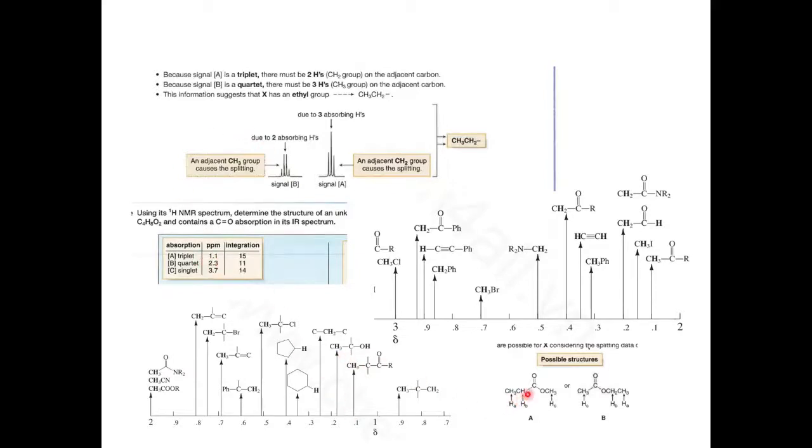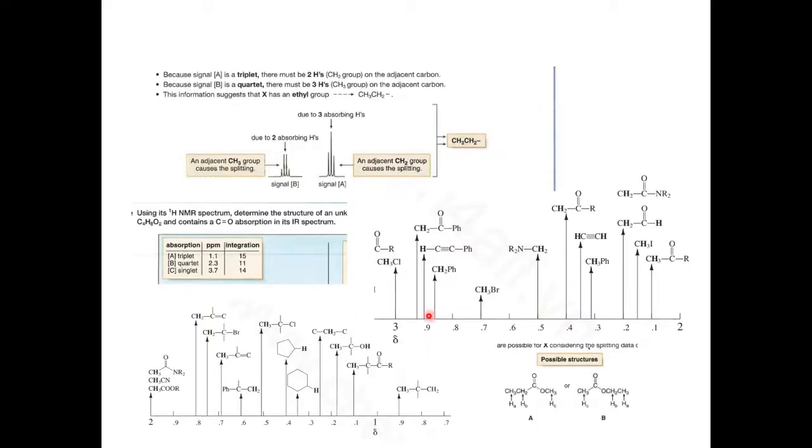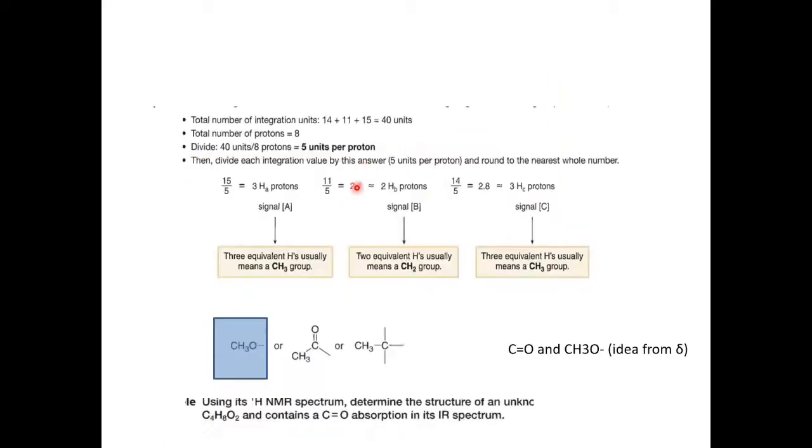So this building block is completed by this chemical shift, and OCH3 is deduced from the chemical shift as well as the ruling out of these possibilities. So this way you can analyze three things in the problem, like chemical shift, splitting pattern, and ruling out the possibility using the chemical shift, as well as the integration of each peak.